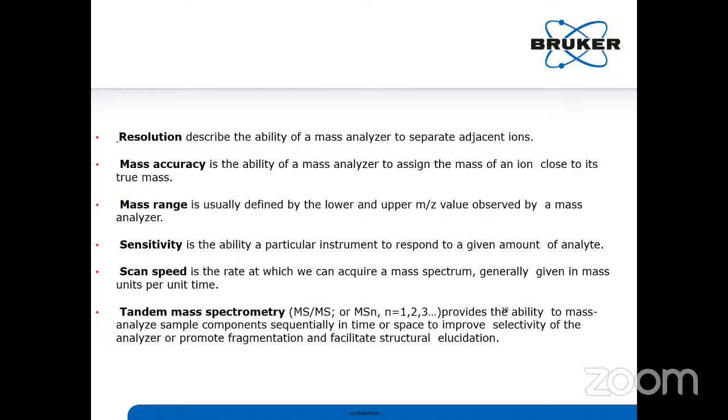Because complete peptide oxidation has happened, so the mass will be the same, but you want to check exactly where the site-specific oxidation happened. In that case, your instrument should be able to separate them even though they have the same mass, based on the site-specific difference. Maybe you can say it will still have the same mass. No, currently we have those technologies. Based upon site specificity also, your ions will get separated.